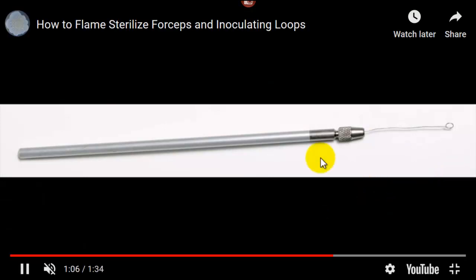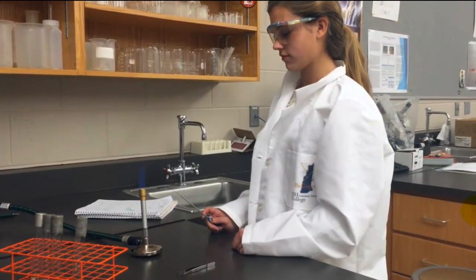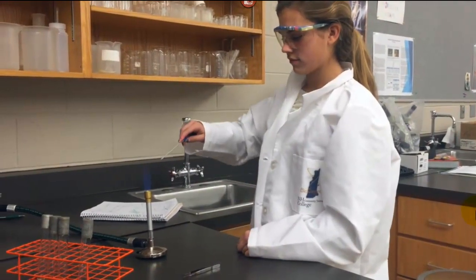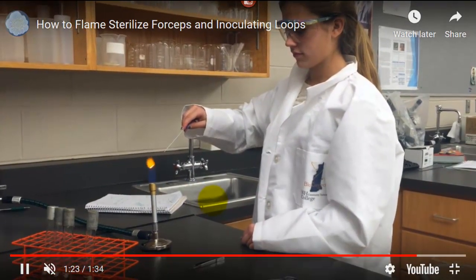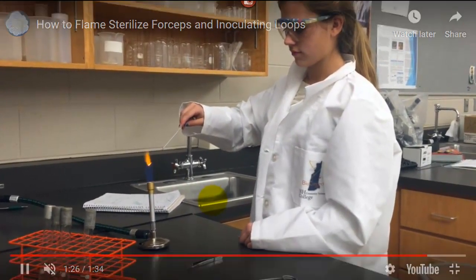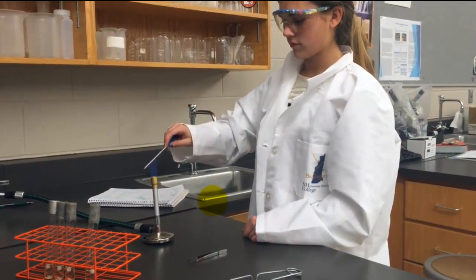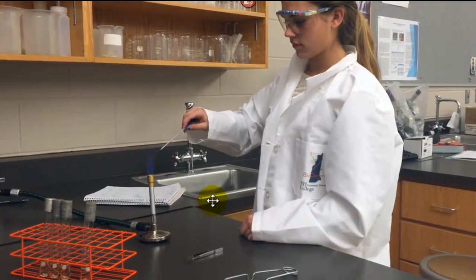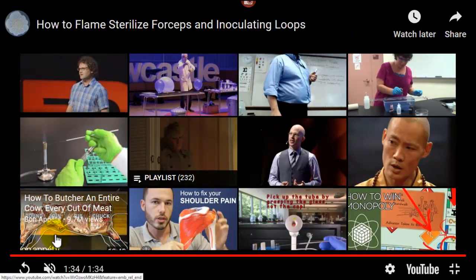So here's an inoculating loop. There's the handle. Here's the loop end that you work with the microbes. And when you sterilize a loop, you start with the end that's close to the handle first, and you work your way out toward the end. Now she is basically just heating up the end of this bad boy. There we go. So see how she kind of had the handle in first? Anyway, that's how to sterilize a loop.